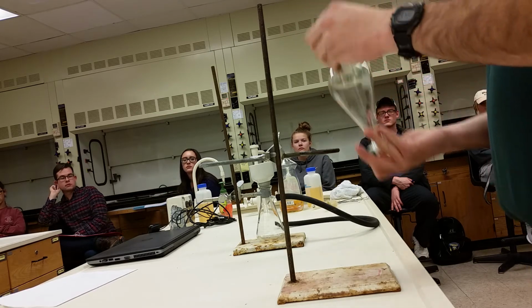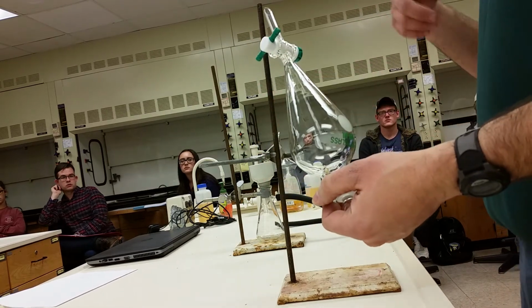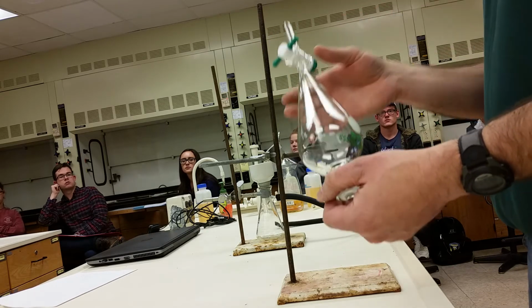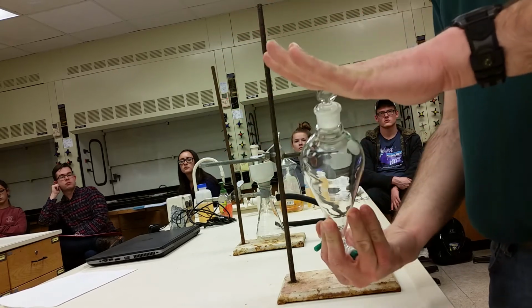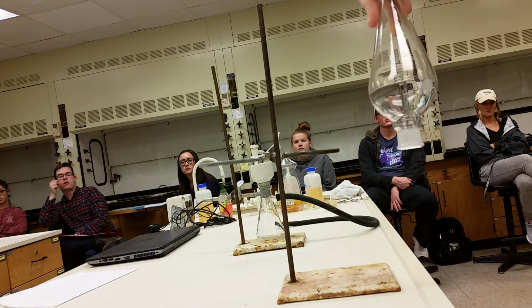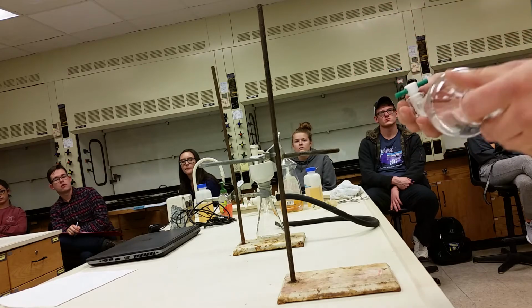What you have to do is put the lid on, take the separatory funnel, and you need to shake it. Okay? The sloshing allows the solvent to move and allows you to have the transfer of the compound between the two layers. While doing this is going to build up pressure. So you need to release the pressure. You always have to have your hand on the stopper. If your hand comes off the stopper, the contents inside can come out. Not only that, but they can get all over your hand. And that's not a good thing. So always have your hand on the stopper.